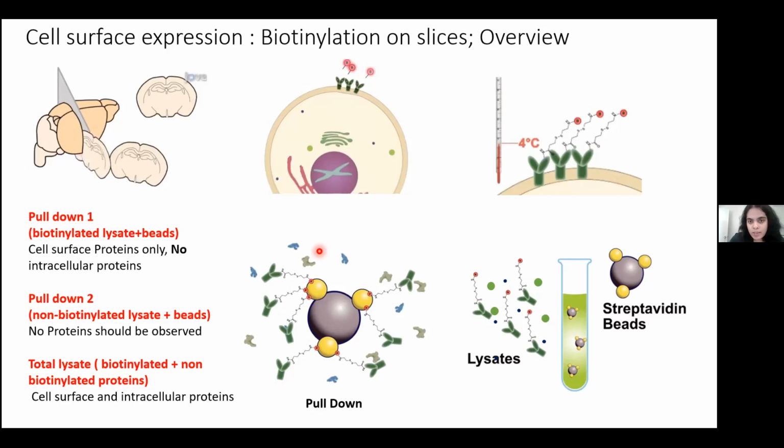So in tissues of interest, you can collect the tissue and lyse it, and you know that in this region of the brain, cells express this protein at the cell surface. I don't know if you can do that in flow cytometry. You can choose a region of interest within the brain and lyse that region to test for cell surface expression.